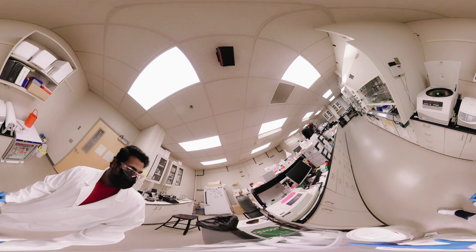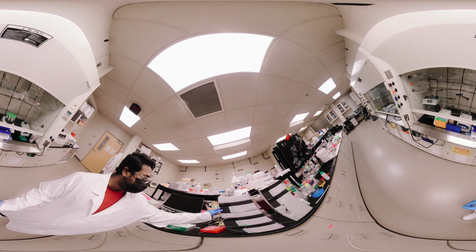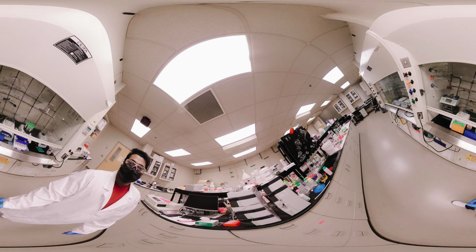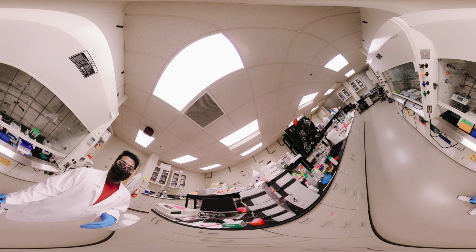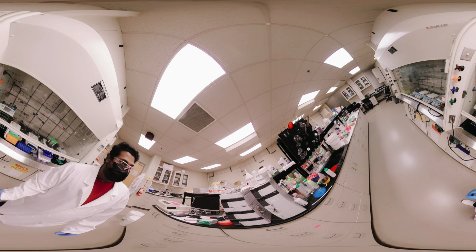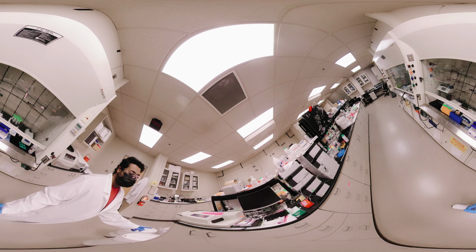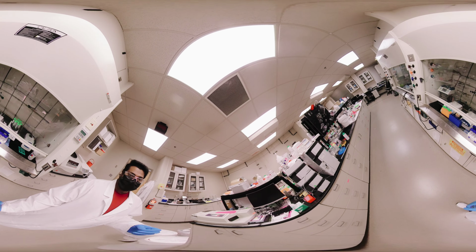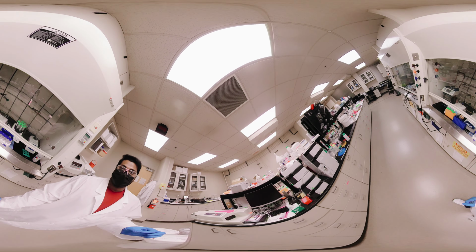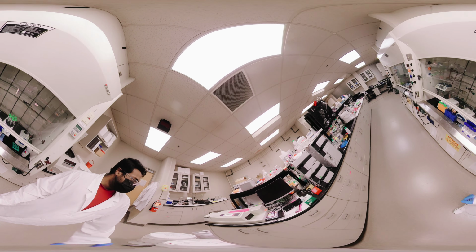We also have an HPLC instrument. This instrument detects a drug on a very small scale to help you measure it. We also have a plate reader, if you want to do any kind of analysis, like measuring how much protein is there. You can measure it using this plate reader.